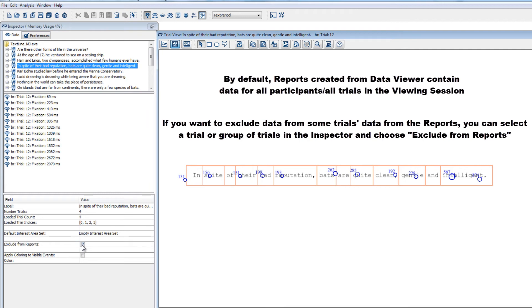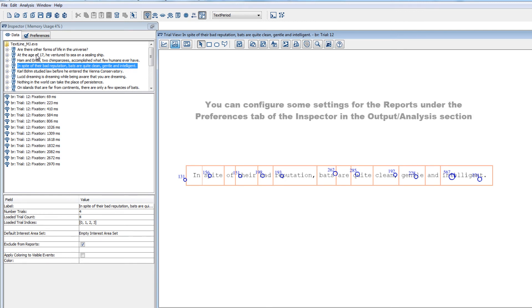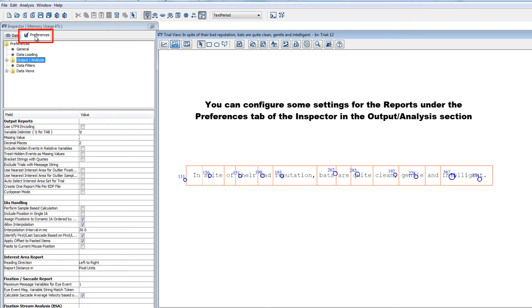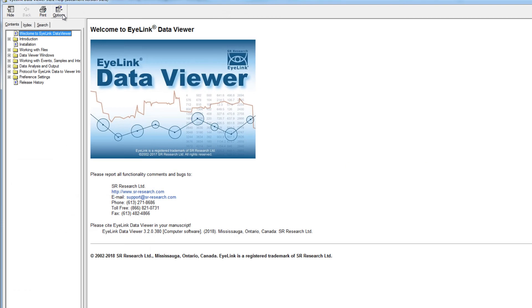The settings of the reports can also be configured under the preferences tab of the inspector in the output analysis section. And you can read more about the various report options and access a listing of variable definitions in the data viewer user manual under the section data analysis and output.